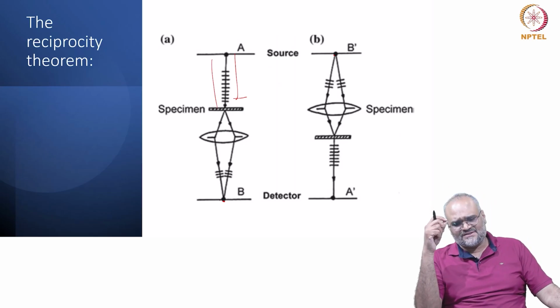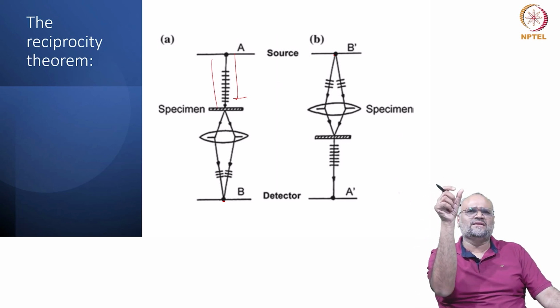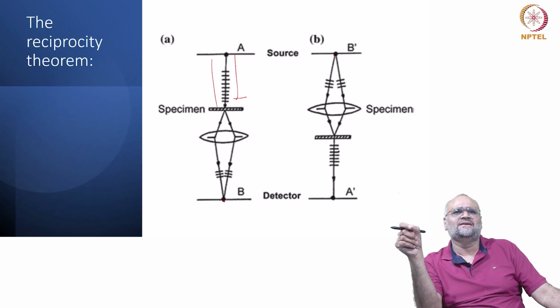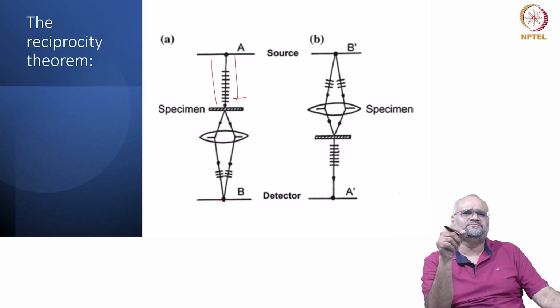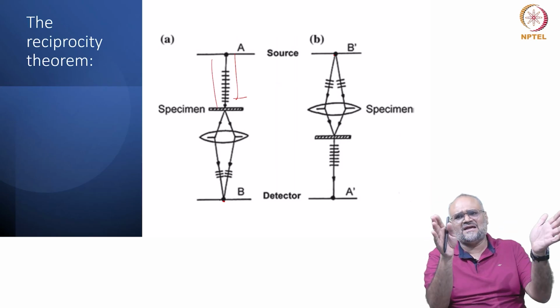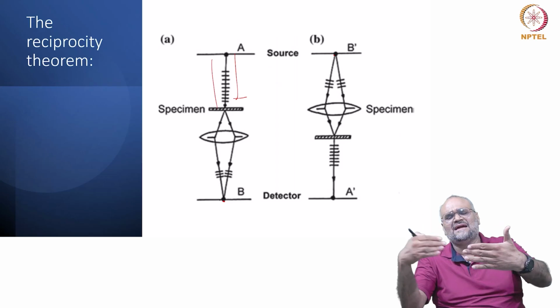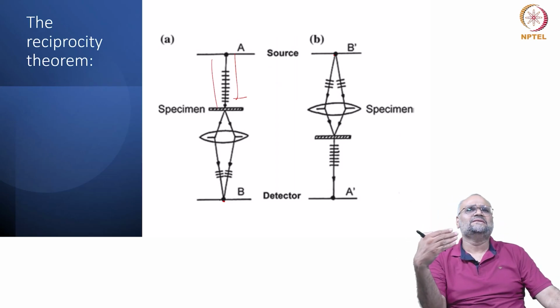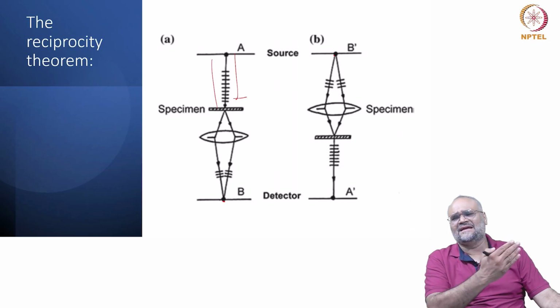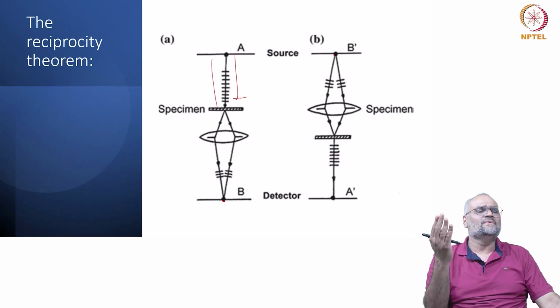And if I swap the idea of a parallel beam going through a lens and forming a spot object at the back focal plane which then interferes to form an image, versus a spot from the specimen diverging and collected on a detector, and by area integration if I am forming the image, it is essentially the same, and the intensities and the entire interaction physics and the mechanism is exactly the same.